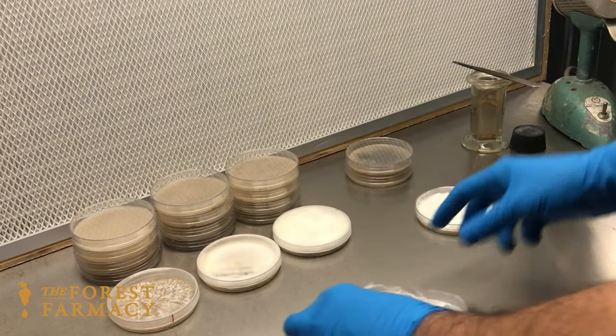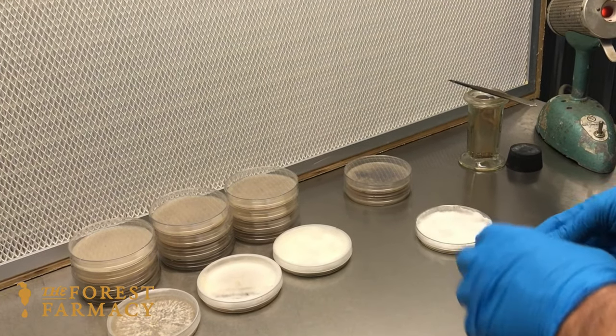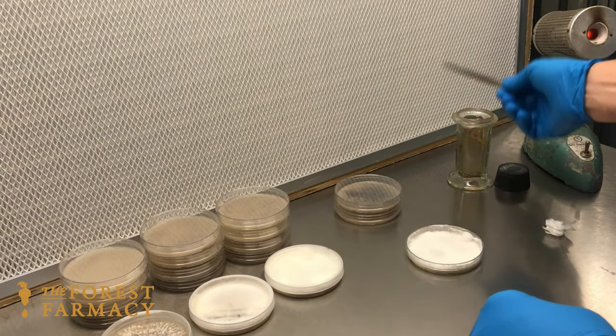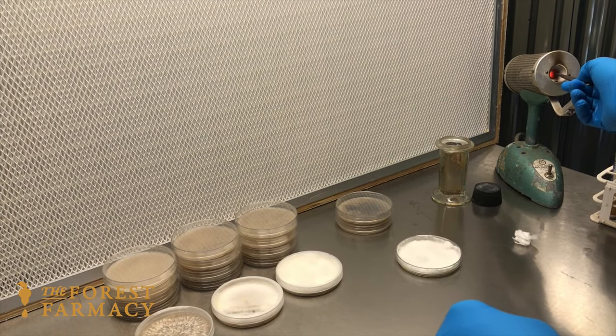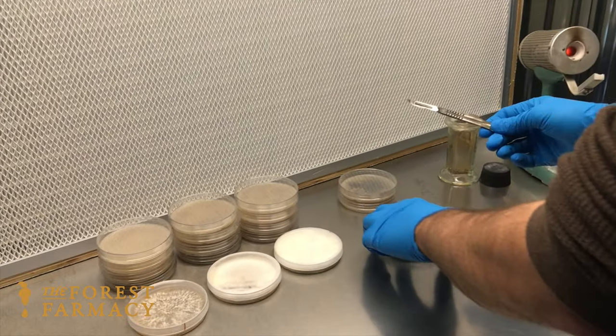...what we call DFA, or dog food agar, and it's exactly what you think — it's dog food and agar. That's been sterilized and we're going to transfer this golden oyster onto here.